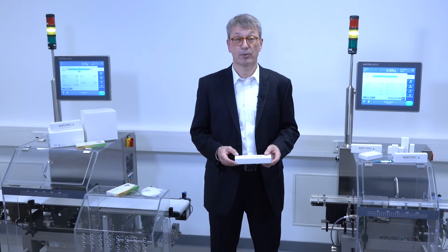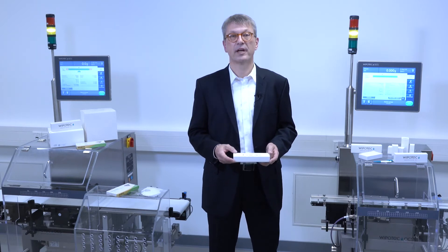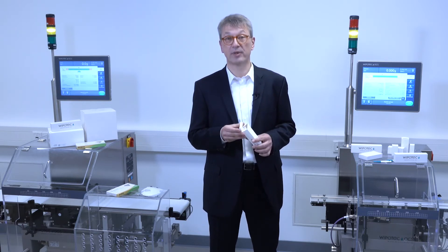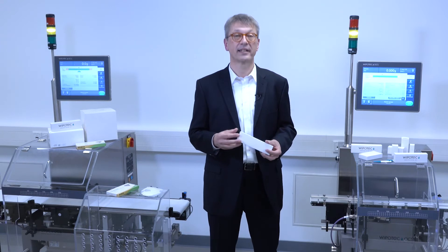With this top-bottom conveyor configuration we can also employ open flap detection on demand. That is a helpful feature when you would like to see if, for example, a flap is not completely closed. After that part we have the weighing conveyor, which is important to detect the weight.